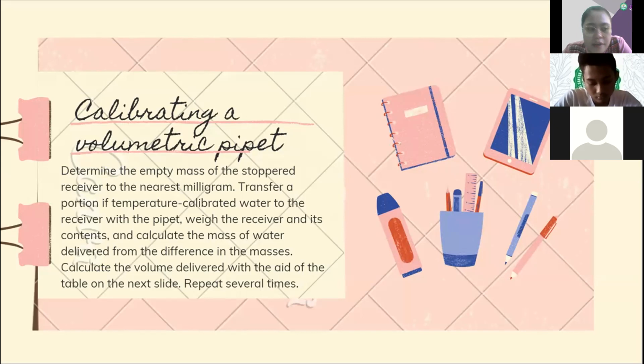Right, when we learned about measuring mass using an analytical balance, it was stated that we have to acclimatize our sample first. If it's coming from heating or boiling, we have to lower the temperature first before measuring the mass because the mass will vary. Likewise, in a volumetric flask, the volume measurement also varies depending on the temperature.